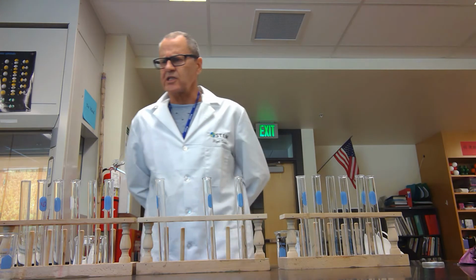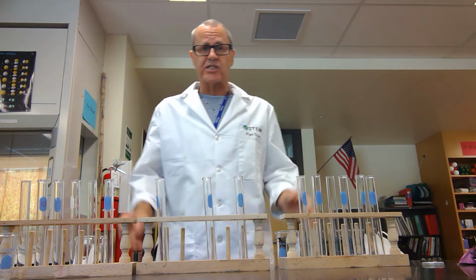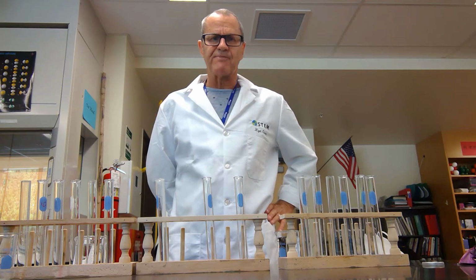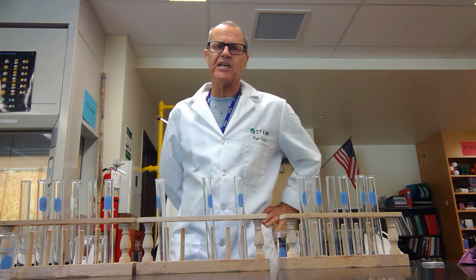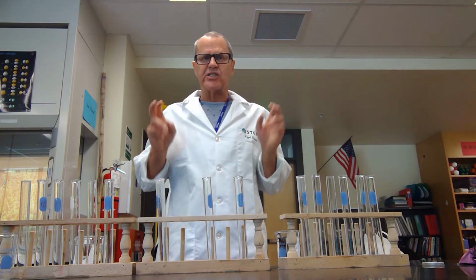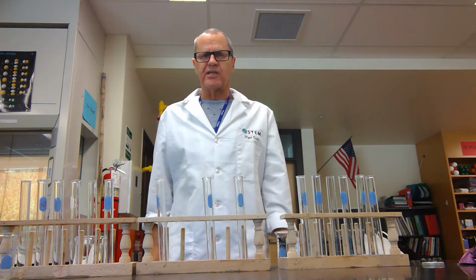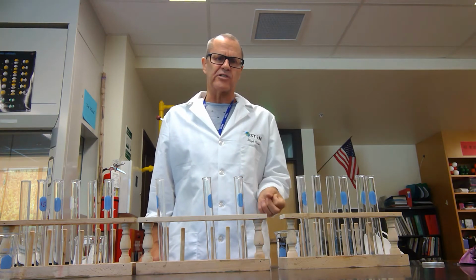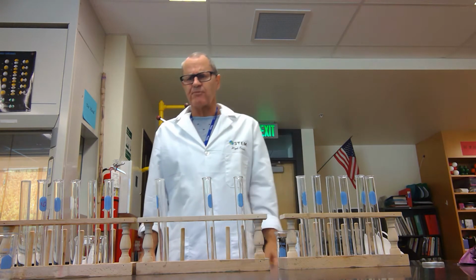So what we're going to do today is generate some data. The data today isn't going to be particularly numeric. It's going to be about pH. So pH, you'll be aware, it's a measure of how acid or how basic something is. And you probably did something about it back in middle school or even elementary school. But this is going to add something to it.